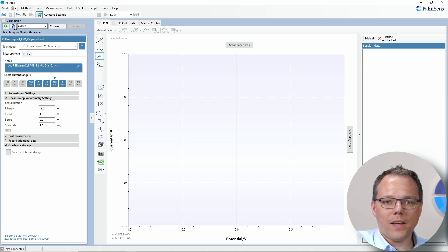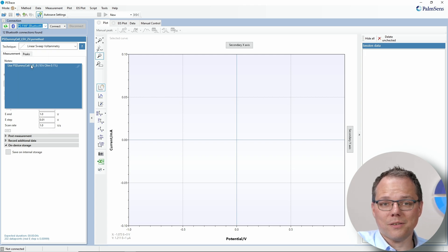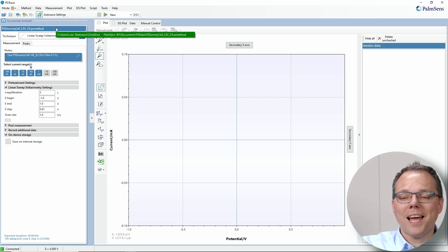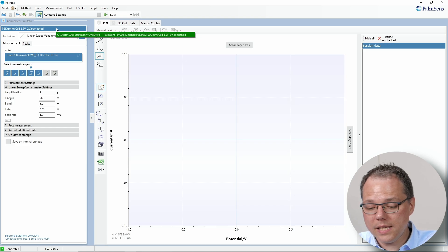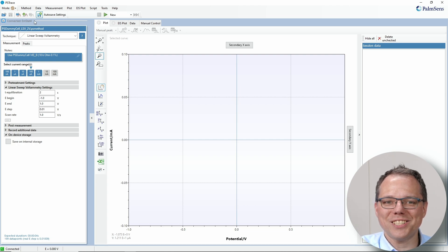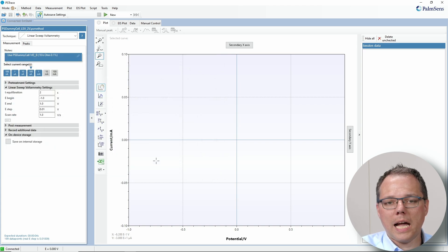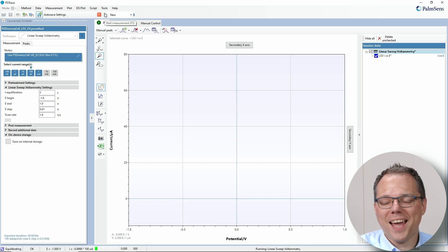Here's PS Trace. In the top left you find the Bluetooth button that starts the search for Bluetooth devices. Once it has found all devices, it lists them in a drop-down menu. My number is PSF46F, so I select that one and press connect. Now it has connected to the EmStat 4X — you can also see the Bluetooth icon on its screen. For my first measurement I want to keep it easy: I choose from the method menu the load option, then select PS dummy cell LSV 2V, and PS Trace automatically loads all the settings I need. I press run and the measurement starts.